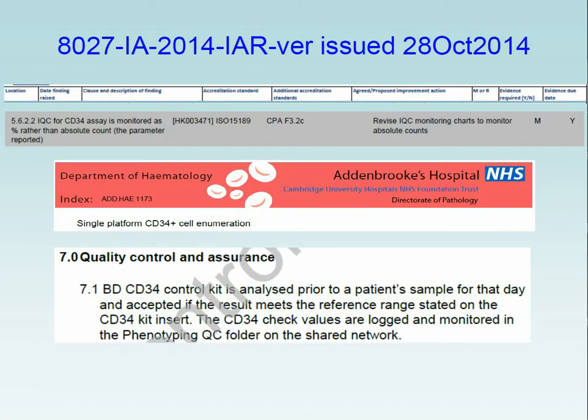IQC for CD34 assay, monitored as a percentage rather than absolute count. We needed to revise the IQC monitoring charts to monitor absolute counts. We were just taking the percentage. And again, a quick change in the SOP said the CD34 check control material values will be logged and monitored in the phenotyping QC folder on the shared network, available to everybody.